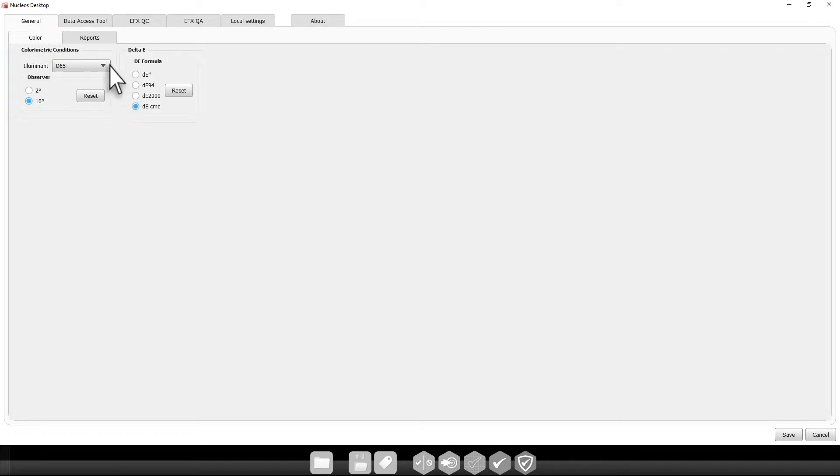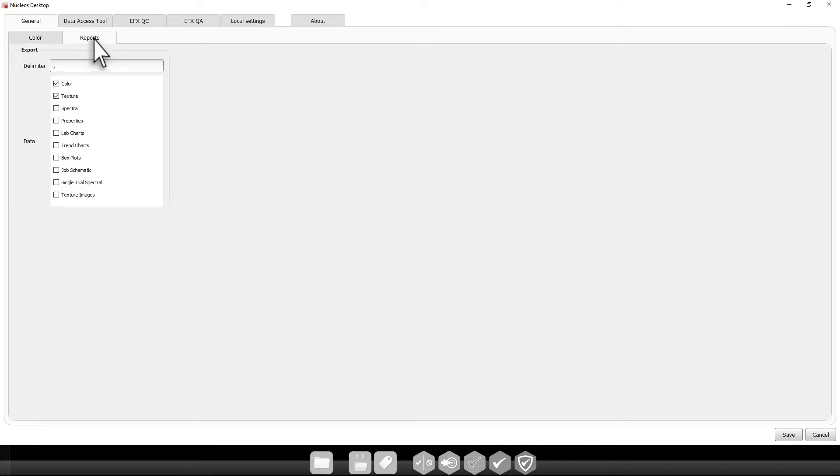The Reports tab allows you to customize what data shows up when a report is exported to an Excel file.